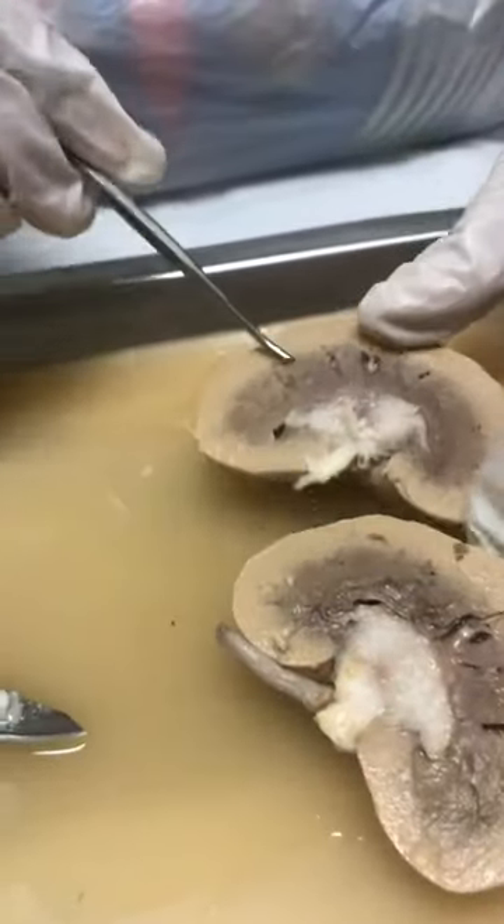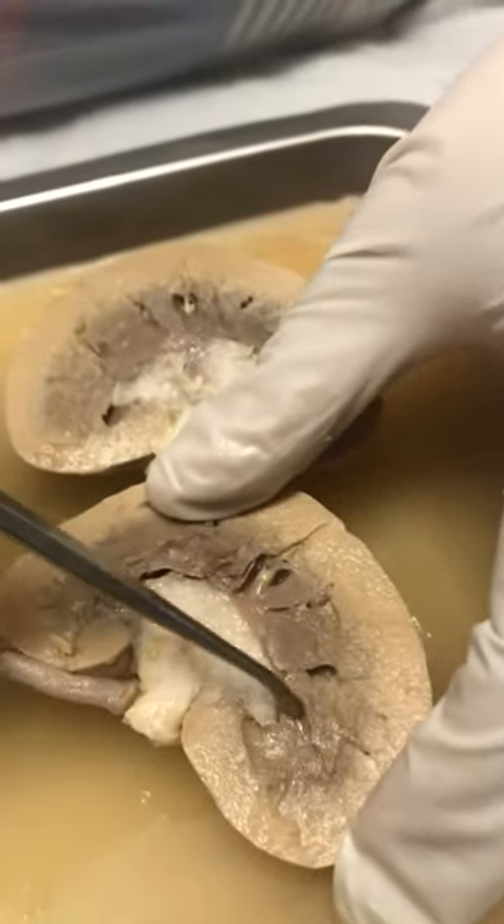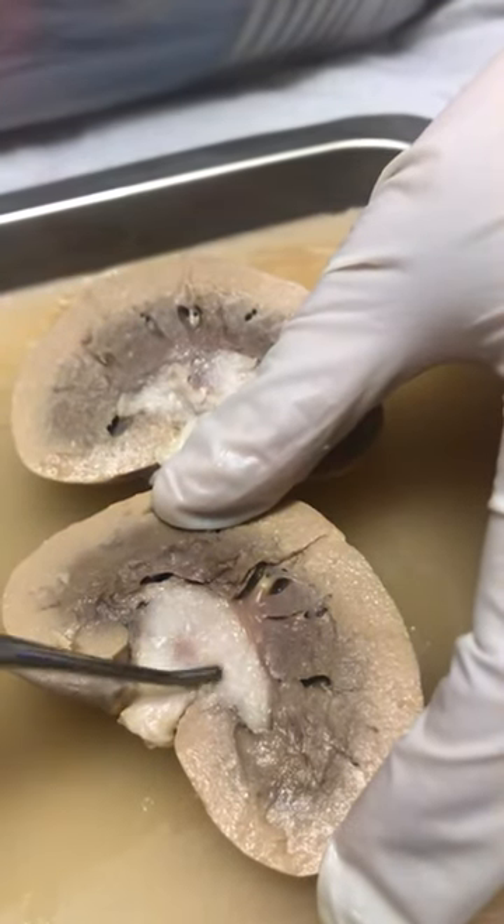It's kind of hard to see because it's kind of dark. This right here is going to be a pyramid. This is the renal pelvis.